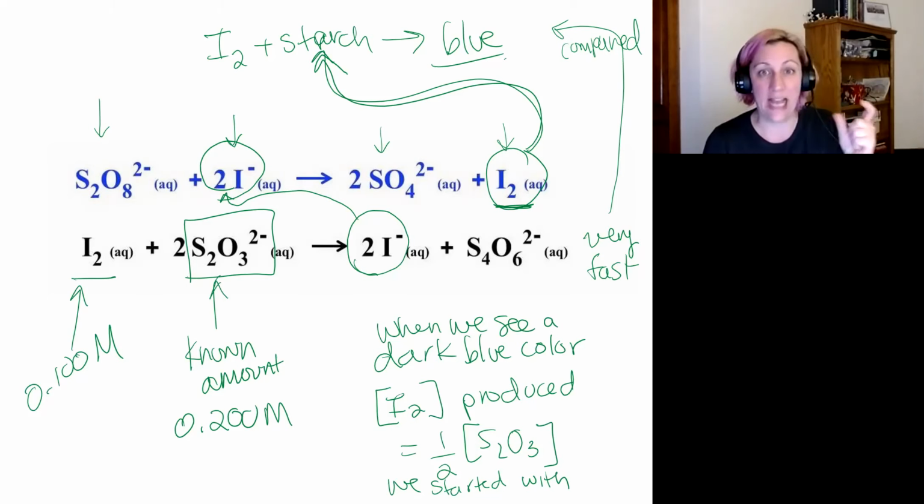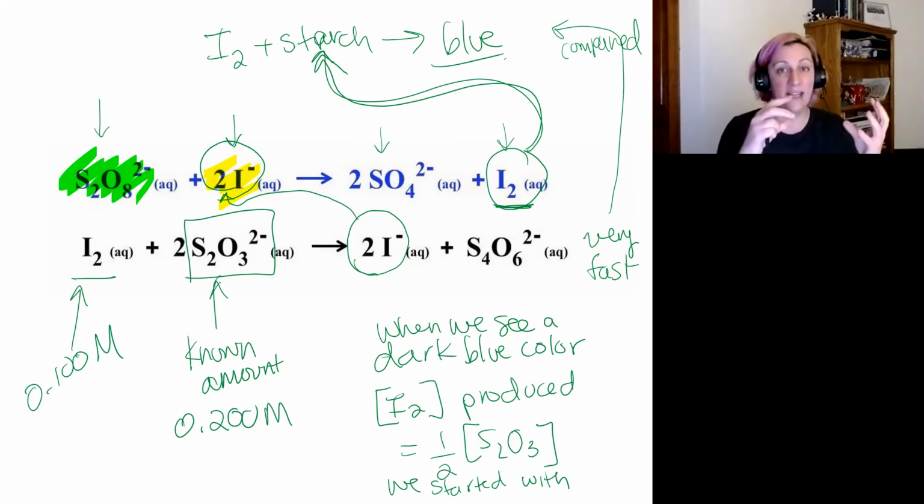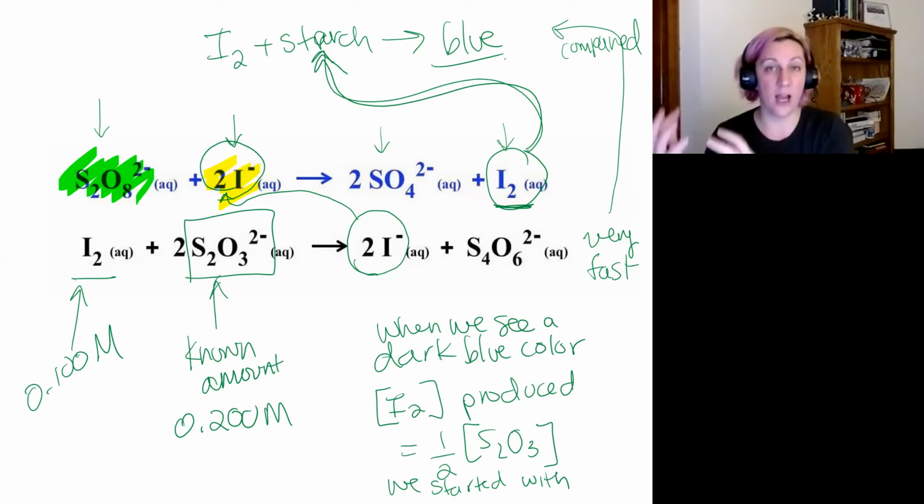And those reaction rates are going to be used to determine the overall order, because we'll do this reaction in a number of different ways. We'll vary the concentration of both of our reactants. And by doing that, we'll see a different rate each time. And we'll be able to look at the dependence between initial concentration and rate, which allows us to derive the order with respect to that reactant.